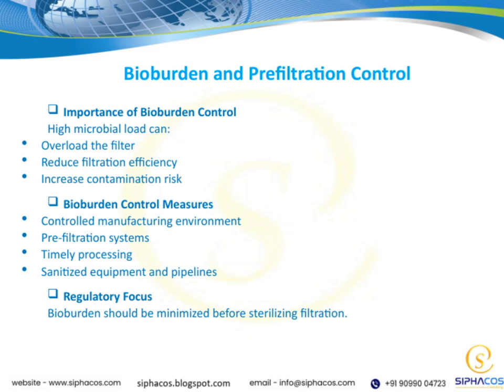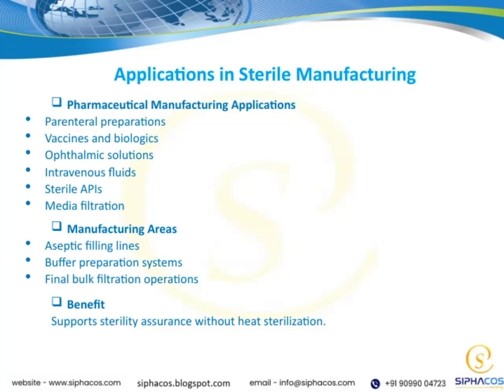From a regulatory perspective, the focus is clear. Bioburden should be minimized before the sterilizing filtration step. This is essential to ensure product safety and compliance. Keeping bioburden low not only protects the integrity of the filtration process, but also supports the overall quality of our final product.